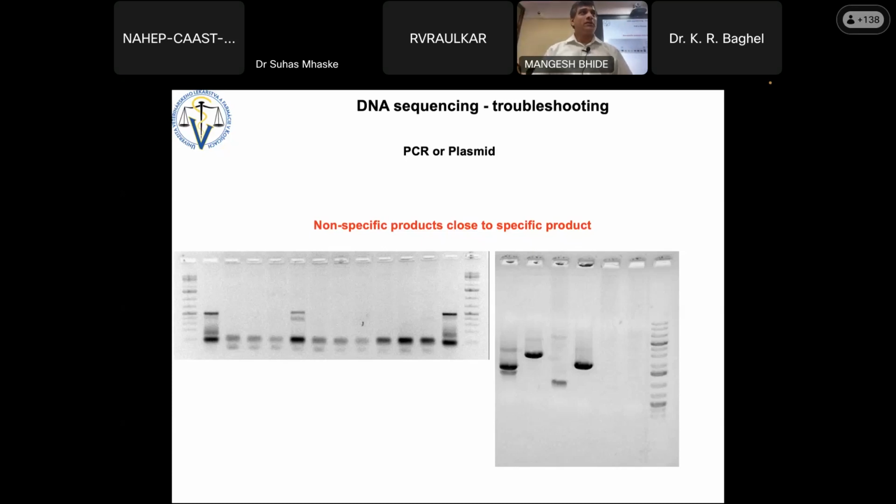It is not expensive at all, and it is not difficult at all. Okay, if you have used column, you just recycle them and use it. So it is very easy to purify. If you don't have columns, you can put ethanol and send it. So ethanol precipitation is also possible.